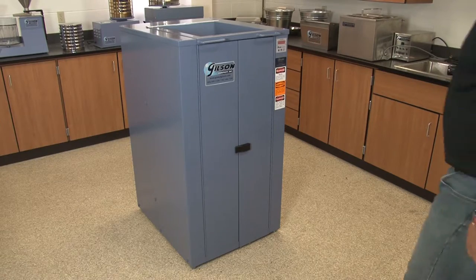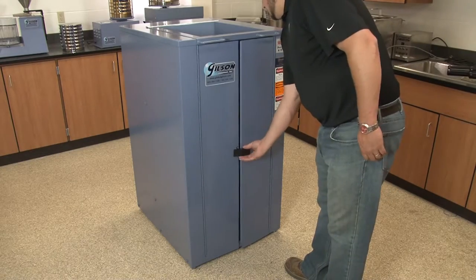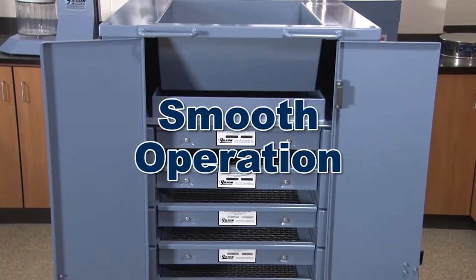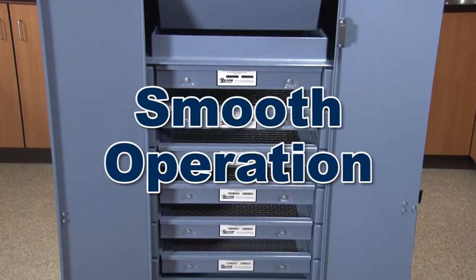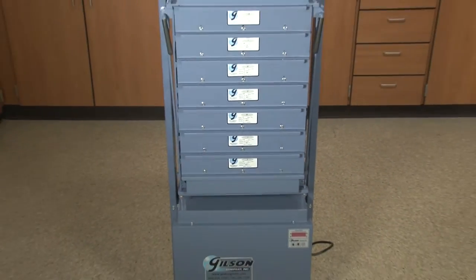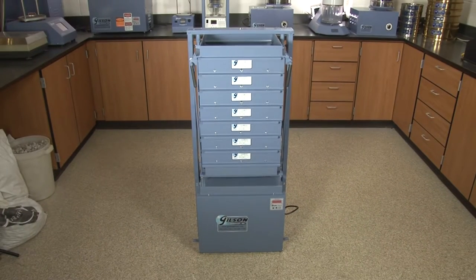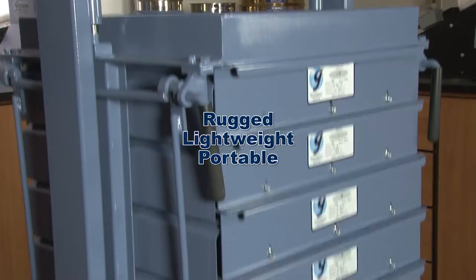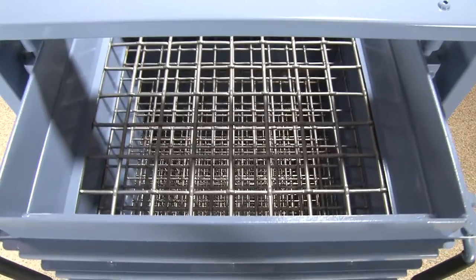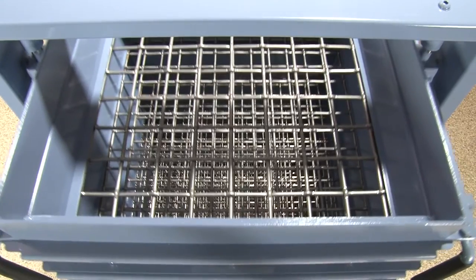Fully enclosed Gilson TM5 and TM6 Testmasters are uniquely designed to be placed anywhere within the lab because of their dependable counterbalance drive assembly. The Gilson PS3 and PS4 Porta screens are designed for high performance and rugged durability, yet light enough to be portable, whether in the lab or in the field.